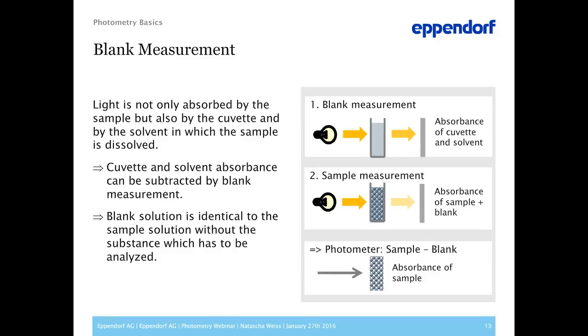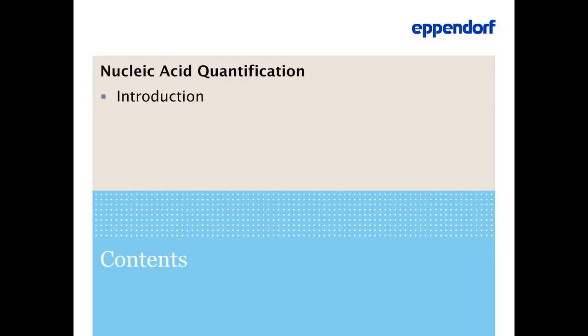So you see the result of your poll, and we see that more than 72% of you are already doing nucleic acid quantification, and additionally 14% plan to do it. I would like to go on with the next part now, nucleic acid quantification. And I will introduce the method first.